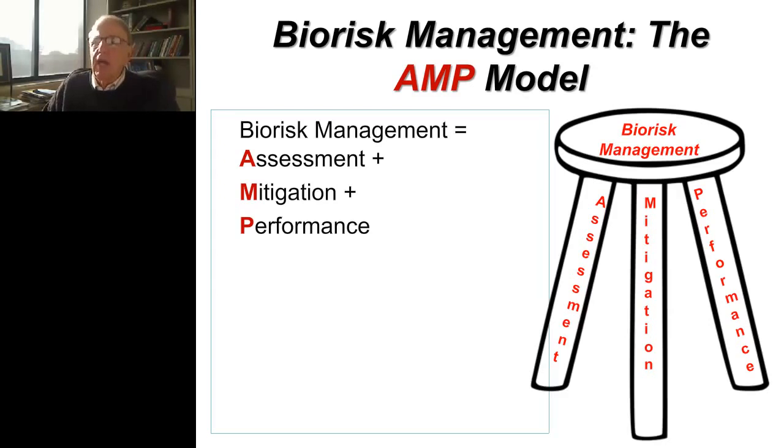Then performance of that requires documenting that gloves are to be worn, training people that gloves need to be worn, and monitoring to make certain that people continue to wear the gloves. So it's a three-part stool as demonstrated on the right: assessment, mitigation, and performance.